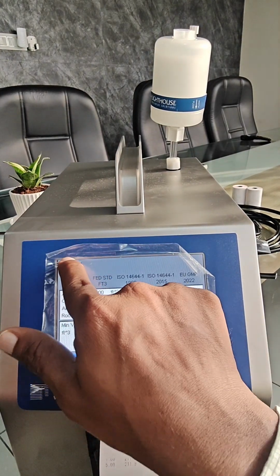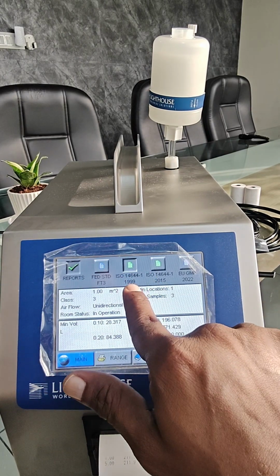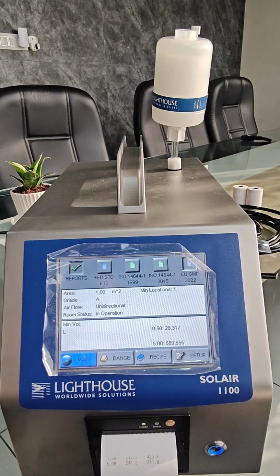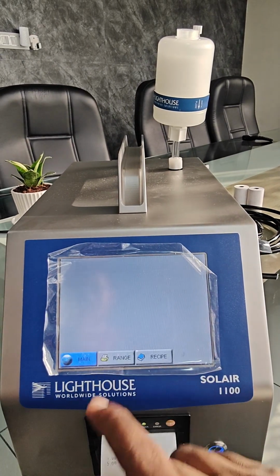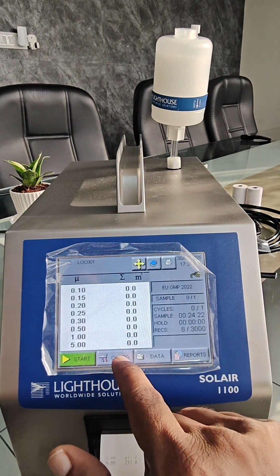If you want whatever ISO 14644-1 1999 or 2015 or EU GMP 2022, then that is also possible in this machine. Okay, just you have to set up the recipe. Also I'll disable that thing first.